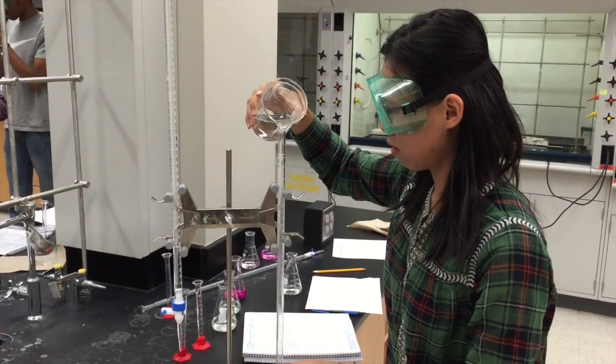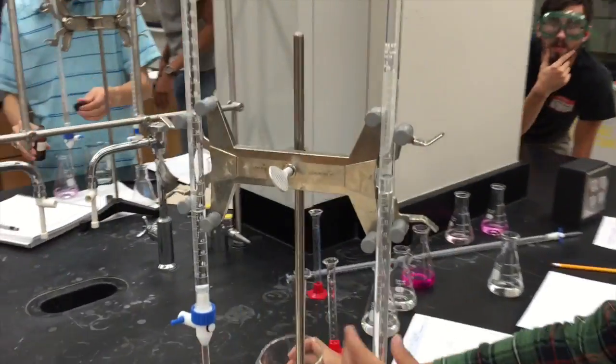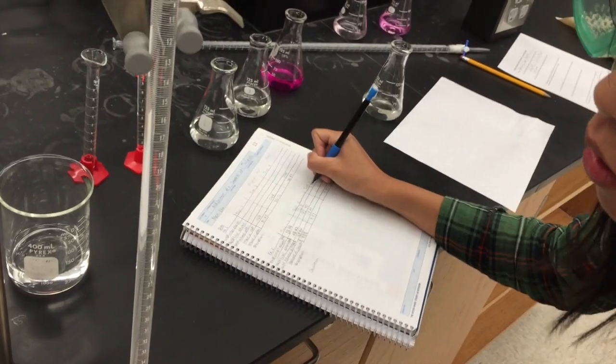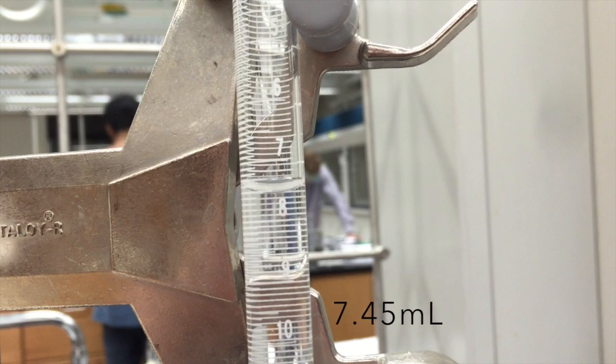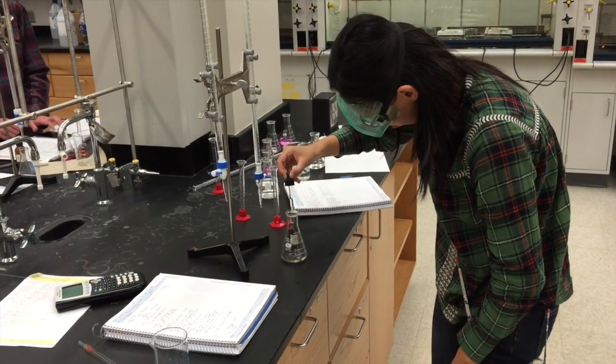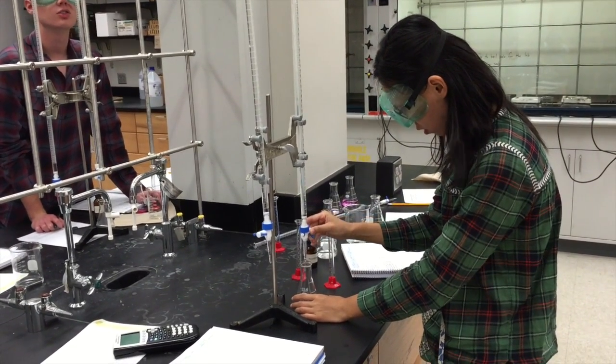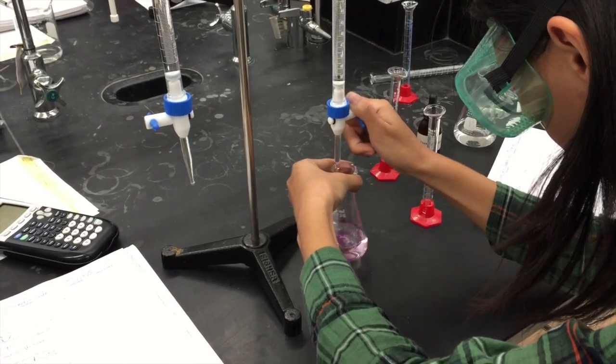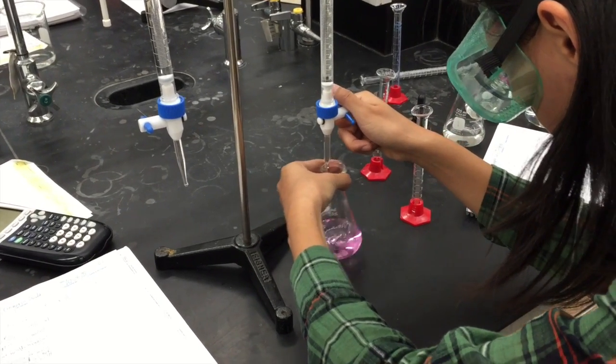In a titration, the solution of known concentration is referred to as the titrant, whereas the solution of unknown concentration is referred to as the analyte. We use titrations to determine the concentration of the analyte by slowly adding some volume of the titrant until a neutralization reaction occurs, usually shown by a color change.